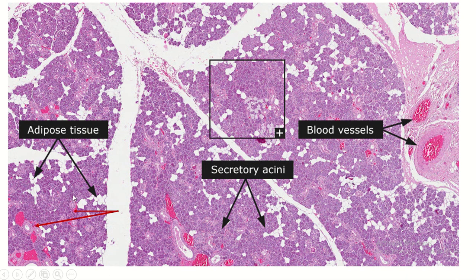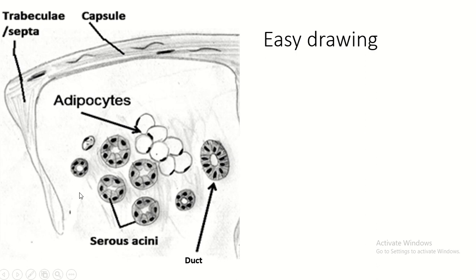This is a low magnification of the histological slide of the parotid gland. You can see this darkly stained area is formed by the serous acini. Within the duct staining, you see there is a light stained area — these are the ducts of the parotid gland. This whitish area is adipose tissue, and this is the trabeculae, the extension of the capsule.